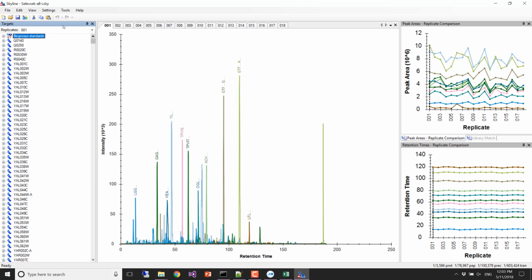So yeah, I think we need Olga's group and Ting. That's right up the alley of what Ting did that Rudy was talking about. I think it's unlikely. These are actually all controlled mixture experiments, so we know what's changing and we know how much we've changed it. And there's really not an easy way to say, oh, I kicked out something that I'm interested in.